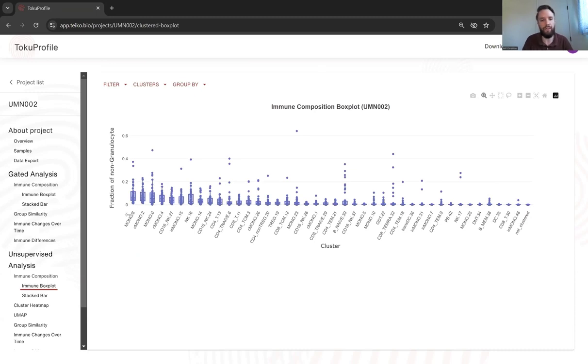And what you'll see is that there are actually more clusters than cell populations that we saw in the gated analysis. I believe our gated analysis had about 31 populations. Our clustering analysis found 41 populations here. So there are 10 additional clusters, which indicates that many cell populations that we gated as being one group might have subpopulations within them that express markers in different ways.